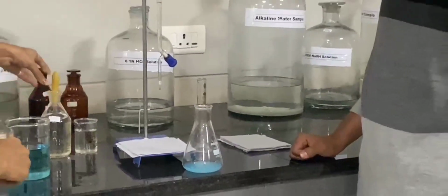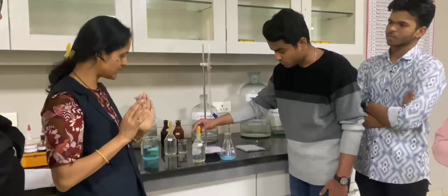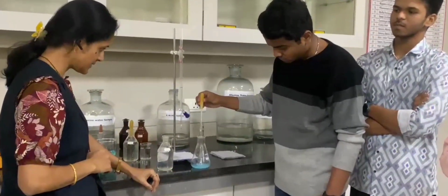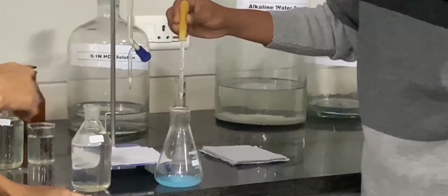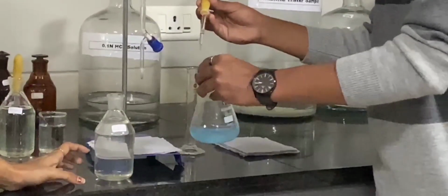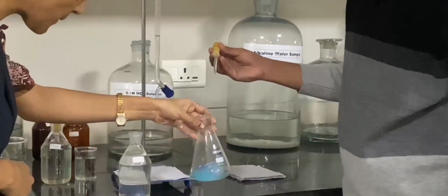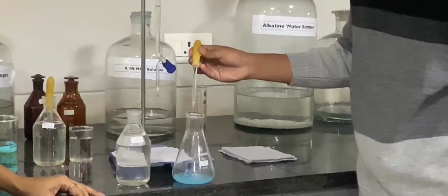Now we have to dissolve this turbidity by using acetic acid. We add the acetic acid till the turbidity is dissolved. Add, shake it. Yes, you can see the turbidity is removed. You can add one more drop of acid.